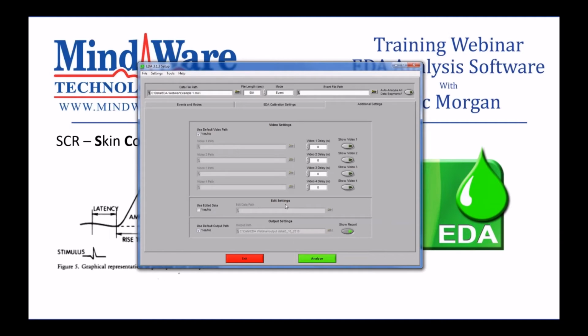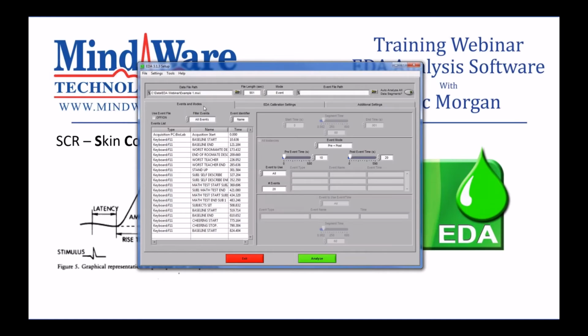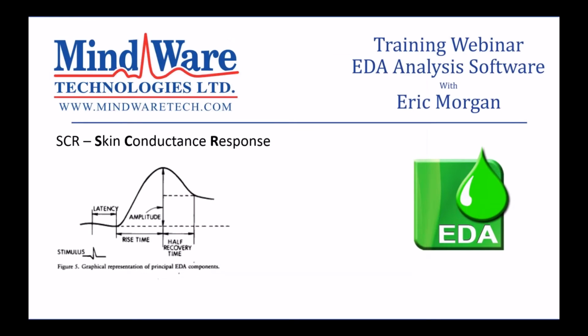And it's where you'll define where the Excel file is written, the output file. And so you can either just save it in this default location, as it always is, or you can specify where you want your results to be saved. So that's pretty much all there is to setting up the EDA application. And I'm going to press the green Analyze button and proceed to the analysis screen.